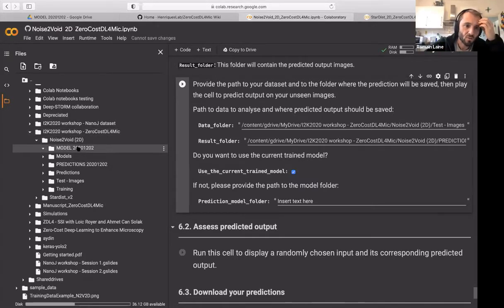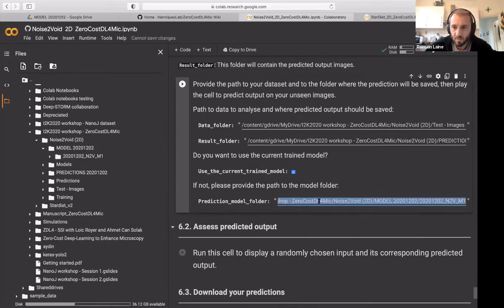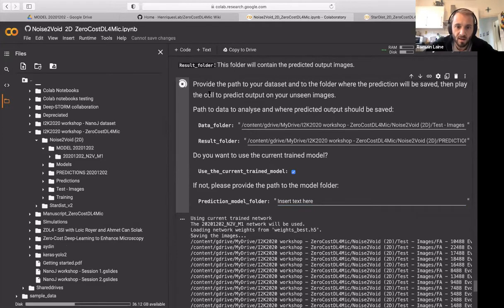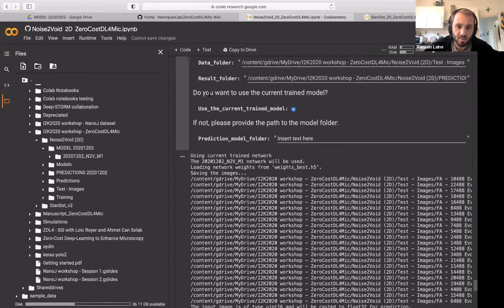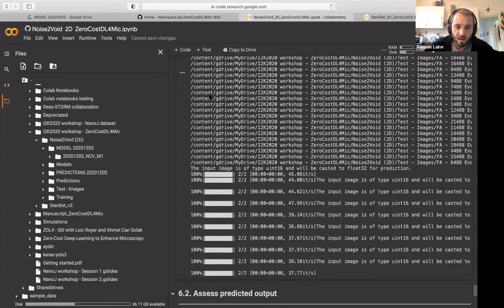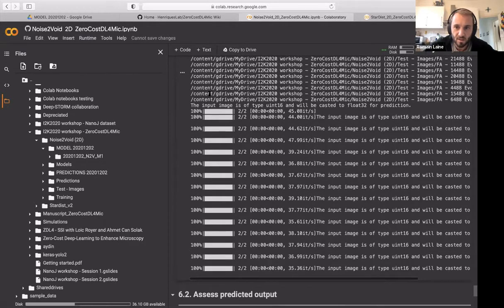folder. Okay. So the way I would do it in this case is take this folder right here. That's the copy path. I could put it in there, but that's irrelevant in this case. And I would paste this path. Okay. So there you go. We can run this, and it's gonna go through each one of those images one by one fairly quickly in this particular notebook. You see how it goes through each data set one at a time.